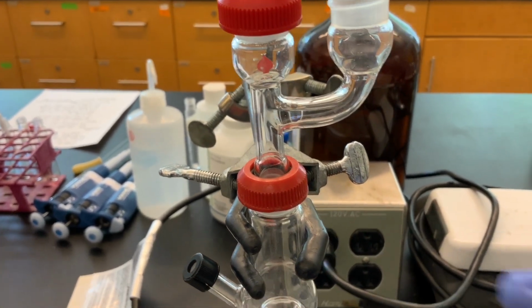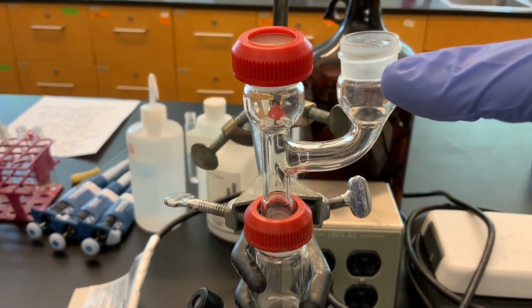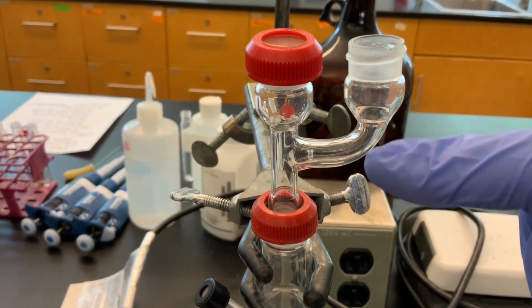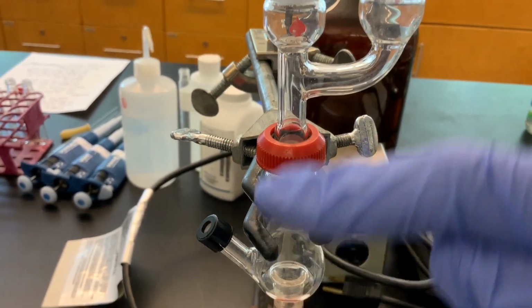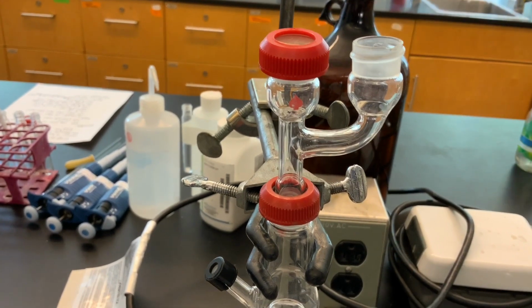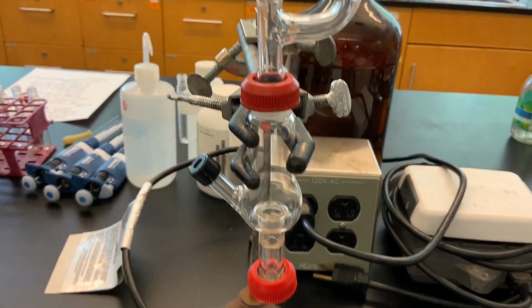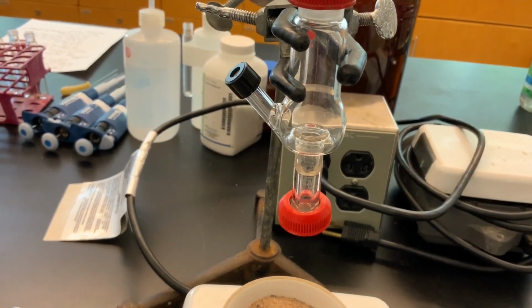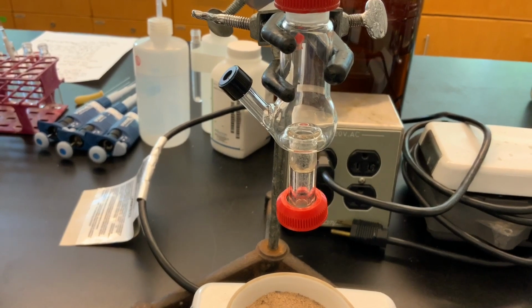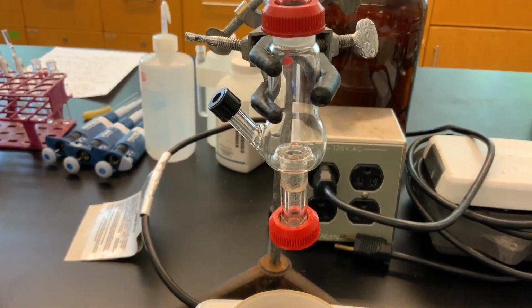It looks similar to a saguaro cactus, with one branch coming out to the right. The one going straight up and down is where we're going to put the probe of our digital thermometer, in order to determine the boiling point ranges of each fraction, fractions 1 through 3.